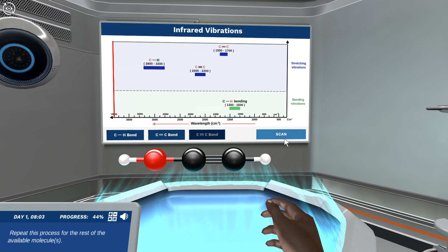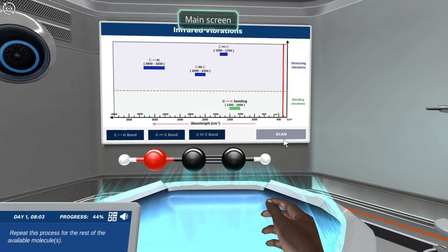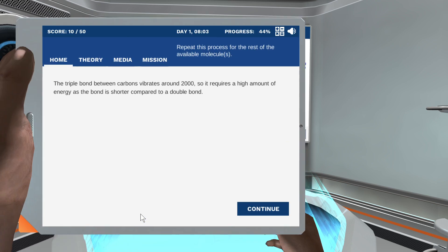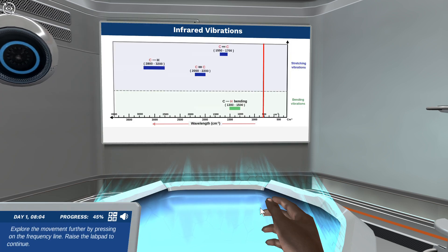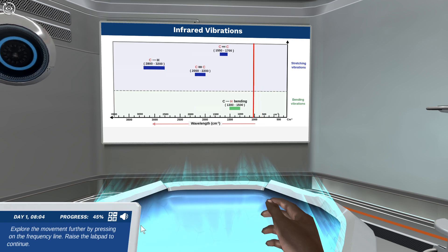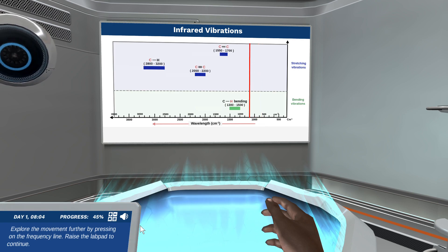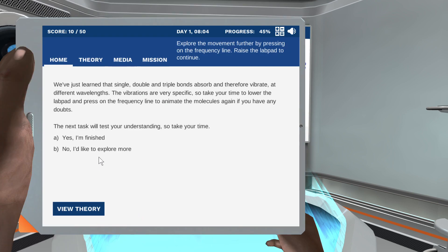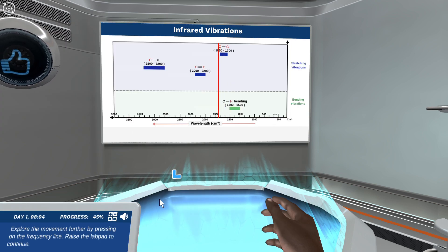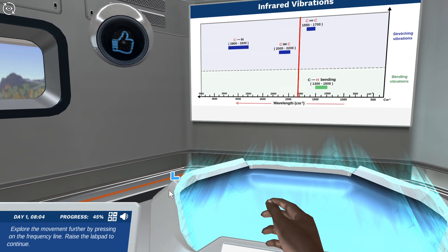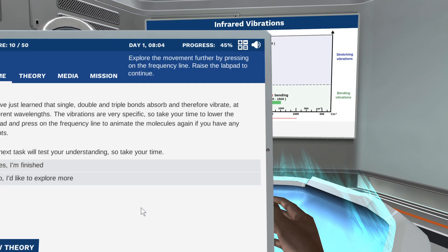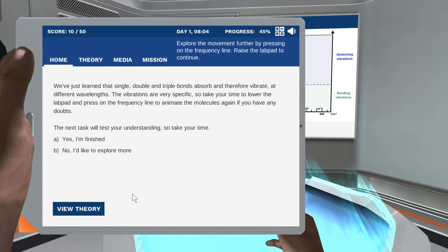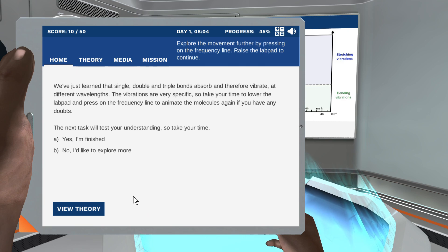The triple bond between carbons vibrates around 2000, so it requires a high amount of energy. By pressing on the frequency line, we've just learned that single, double, and triple bonds absorb and therefore vibrate at different wavelengths. The vibrations are very specific.